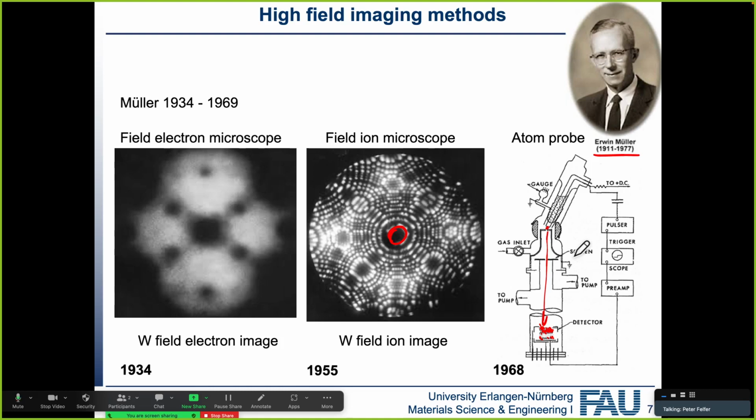All of them are stainless steel, or in our case, titanium, and we use closed cycle helium cryostats instead of liquid hydrogen. But maybe in the near future we might have access to large amounts of liquid hydrogen, so maybe we'll use liquid hydrogen again.